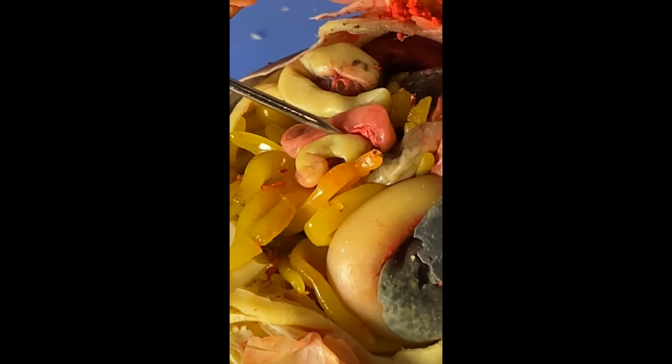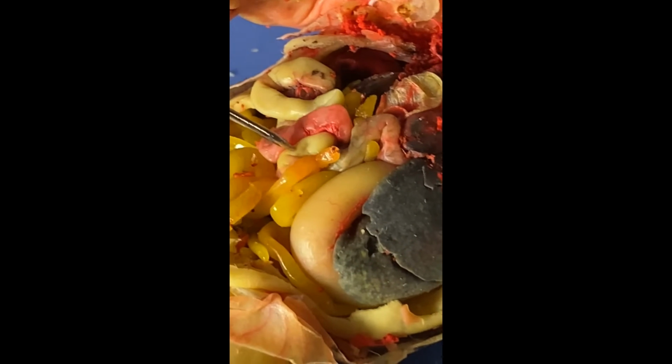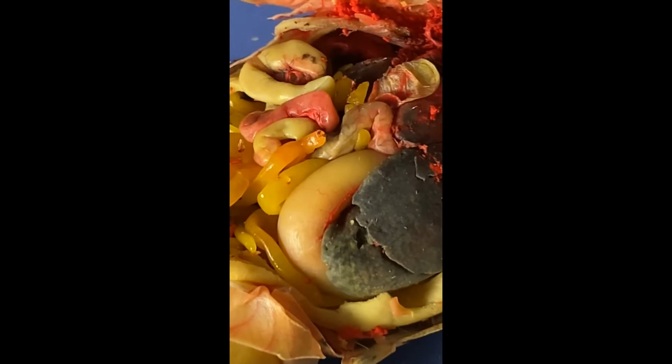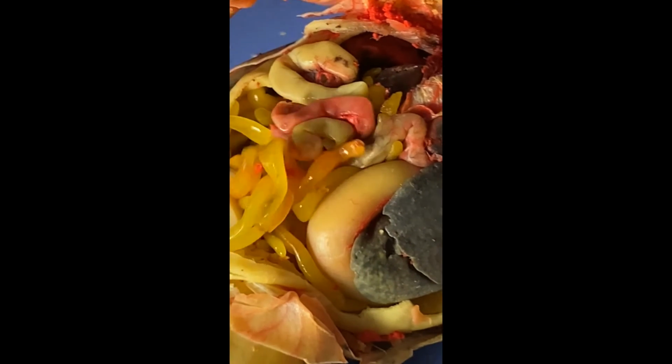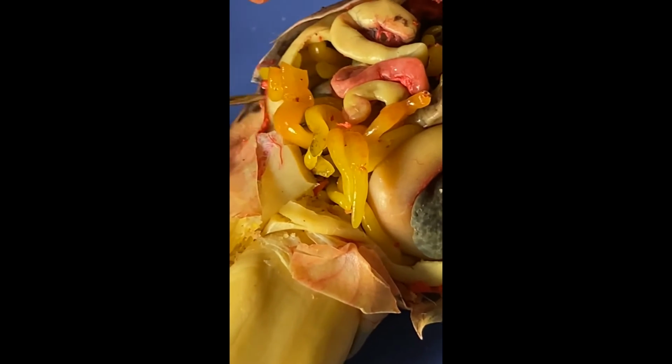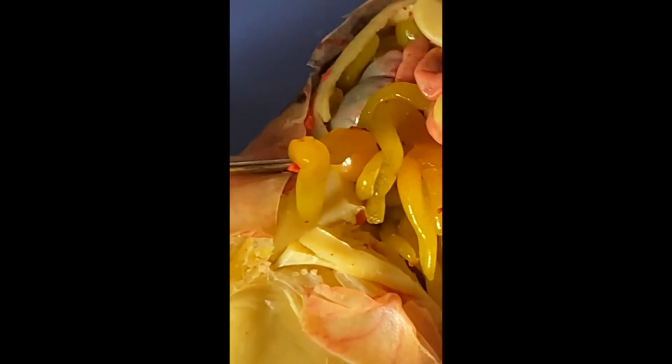This is where enzymes from the pancreas and the liver are secreted, and they help absorb the nutrients of the food. And underneath all of these fat bodies, a little difficult to see, would be the large intestine, which is over here. I'm going to get a better look in the digital microscope.